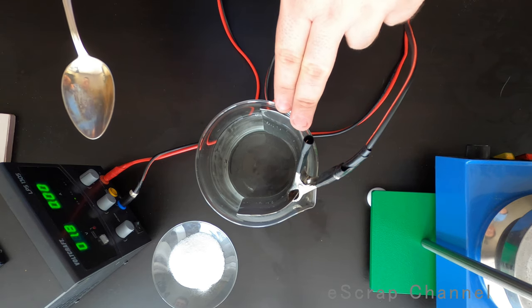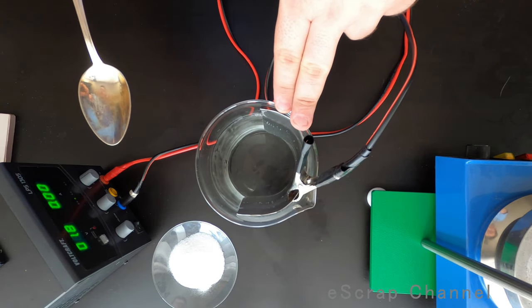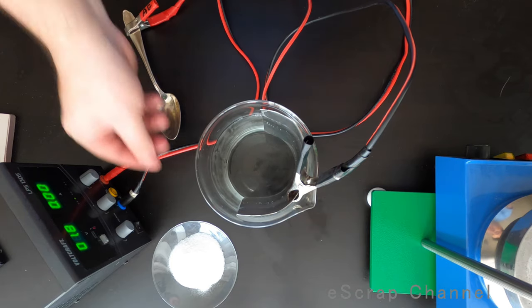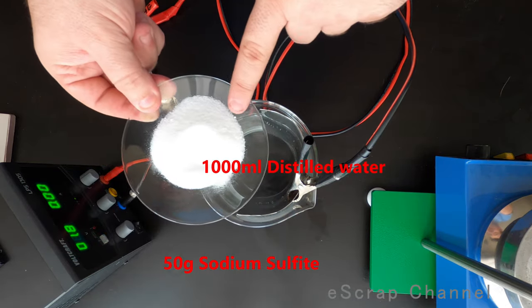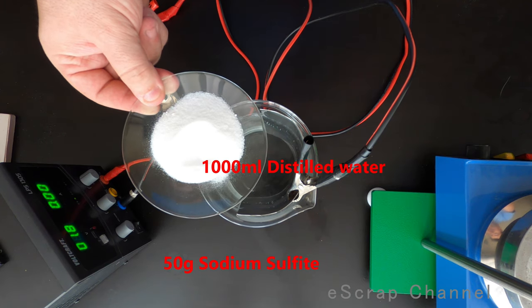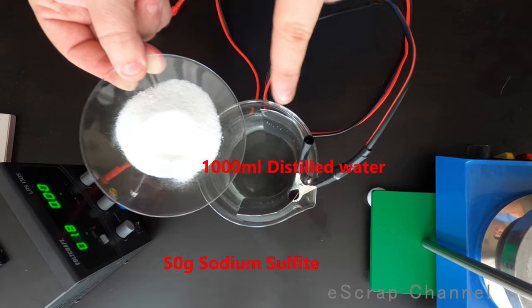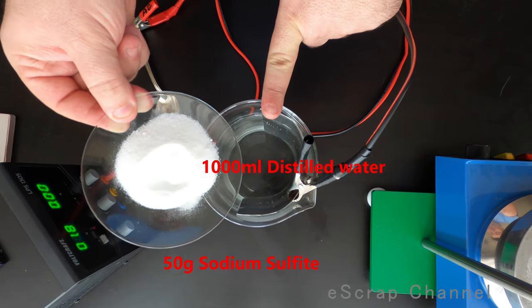As electrode here I use stainless steel and distilled water. What is this white chemical? This is sodium sulfate. 50 grams per 1 liter of water.